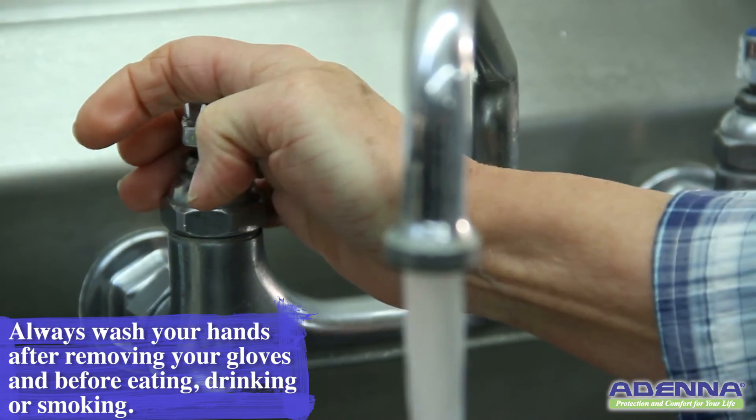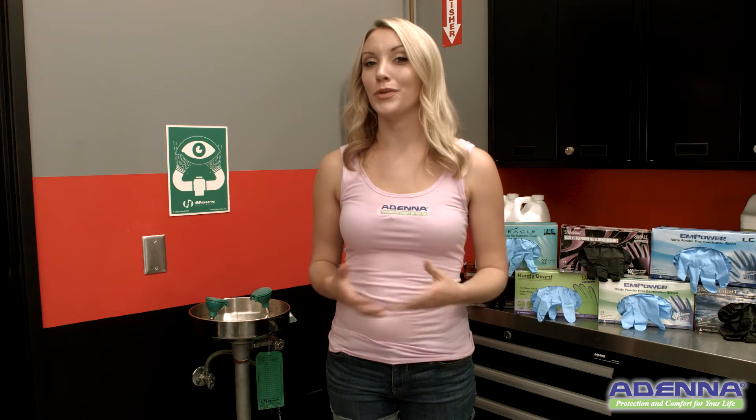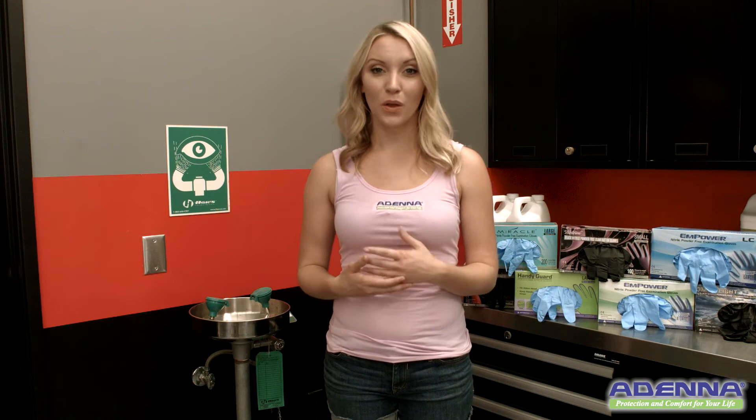Always wash your hands after removing gloves or before eating, drinking, or smoking. Chemical residue from your hands, wrists, or clothing can easily contaminate the things and surfaces you touch.